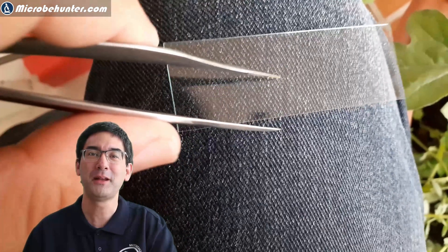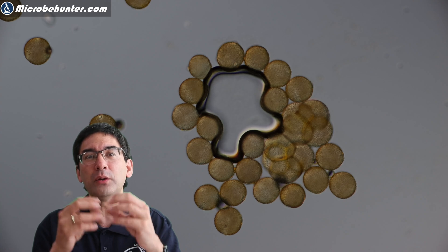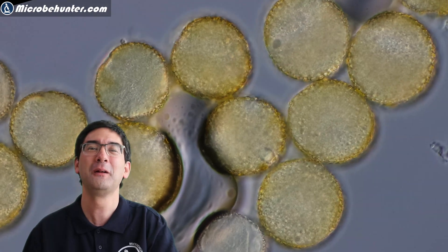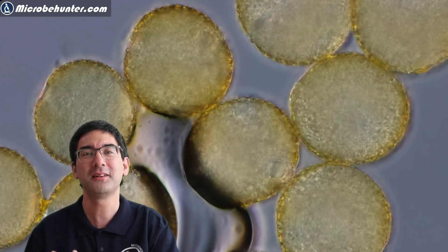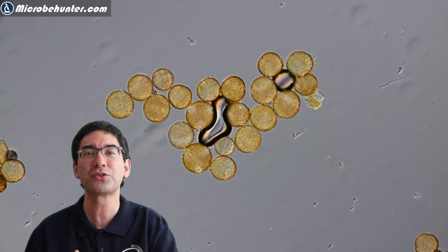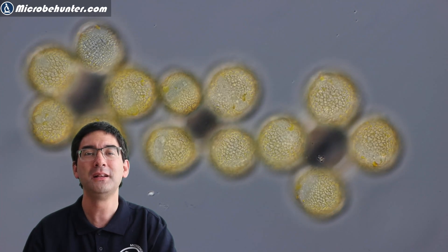I was able to see the pollen, though getting them to germinate was not really successful. If you add sugar water, some species will start to form a pollen tube, which can also be observed under time lapse — but it didn't work here. I'm working on it and hope to be successful in the future. You can also find pollen in honey, and if you put a honey sample under the microscope you can see them there too.